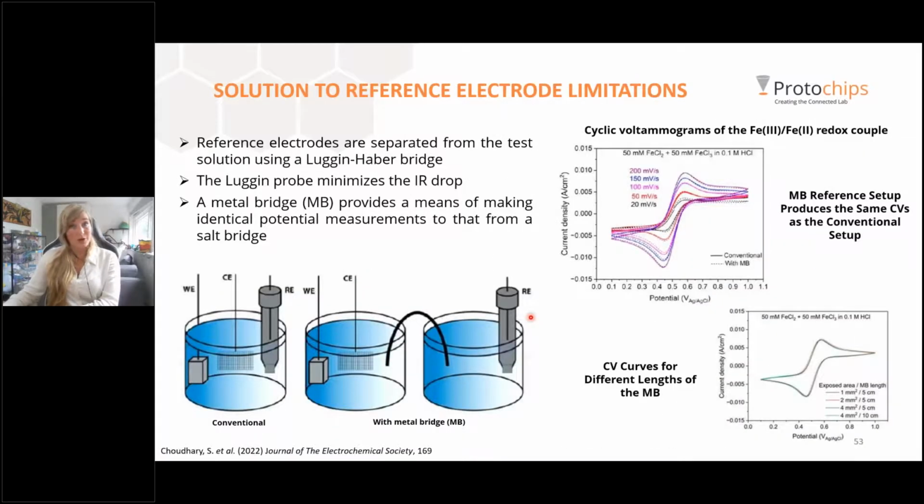To become closer to bulk scale reactions, we've recently developed a standard reference electrode that operates outside of the microscope. These experiments were done to observe if we can change our reference electrode, which is normally on our chip, to something more commercial. Our reference electrode is always located on the chip, and we need to make it out of platinum because that is easiest to fabricate on such a small scale. Putting a silver chloride electrode, for instance, in that small chip in the electron microscope is really tricky, and it will most likely also contaminate your sample.